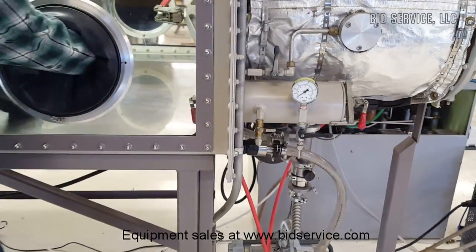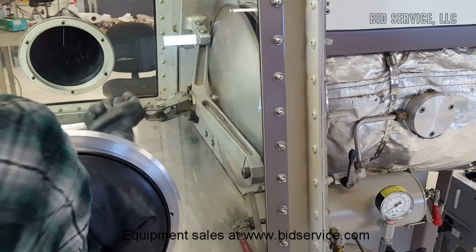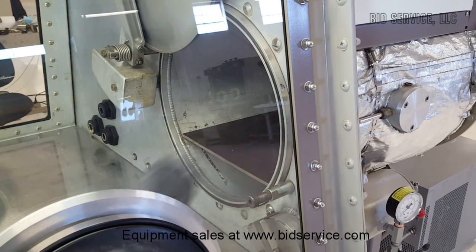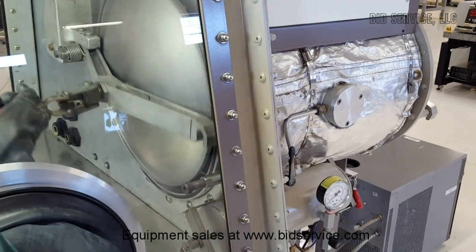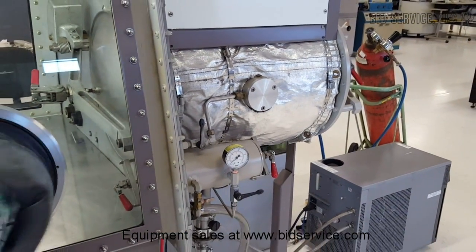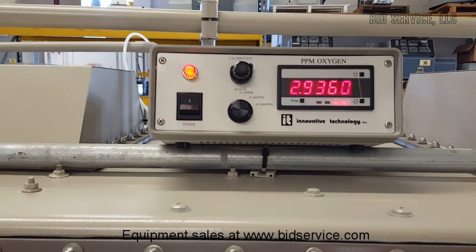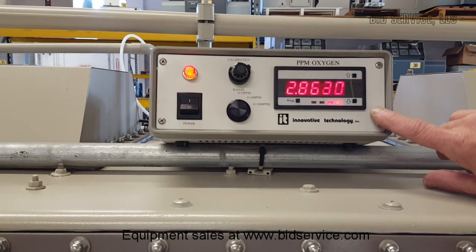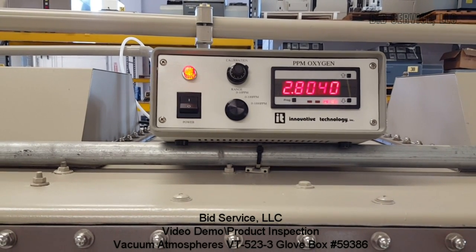We'll open the inner door — this is a sliding shelf, just a temporary shelf in there, and you could bring your work in at this point. After doing the transfer and opening that door, I did a quick cycle but without fully evacuating and refilling, and as you can see we got a little burst of oxygen inside our glove box. The purifier is now working to bring the oxygen level back down — you can see that it is working.